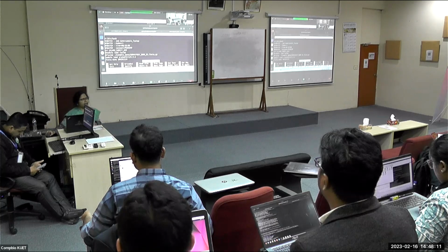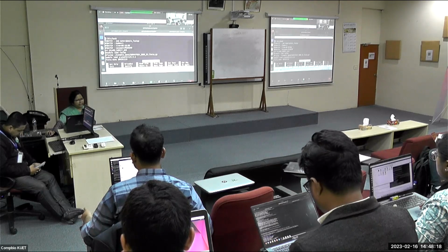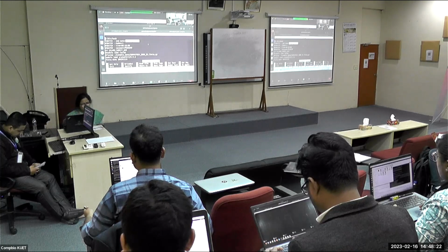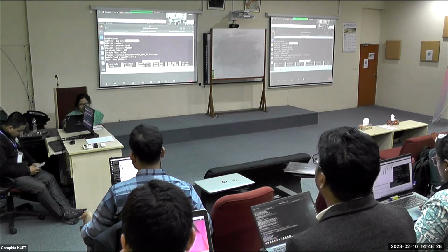There is this kind of format, right? You already are very used to this. So here in the job name, we can just write something, it's for our reference. It's not for anything else. It's for our reference. We can write that it's alignment.